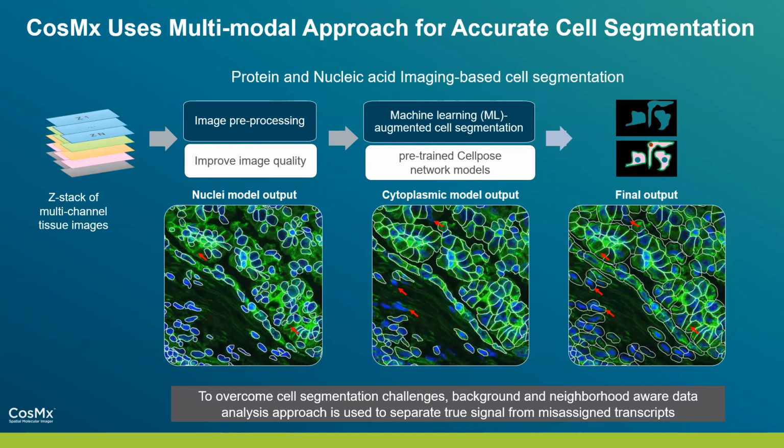For example, there's a cocktail that we use, beta-2 microglobulin and CD298. And there's also a couple different markers we can use as well that help to influence cell segmentation as well. So really nice approach that we have. And that's all about helping us to assign the transcript in its correct physical home within the cell. And I'll show the impact of what that makes across tissue.